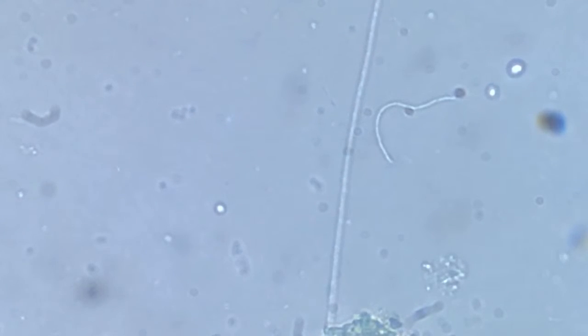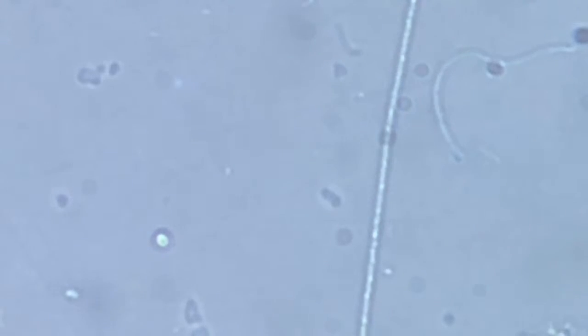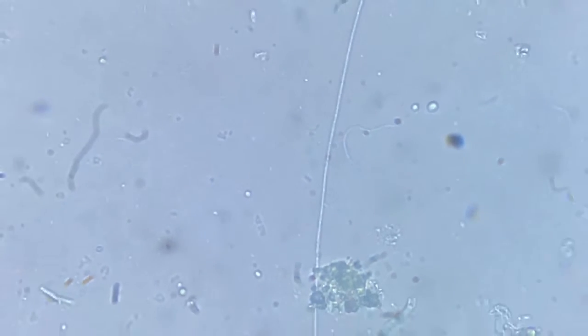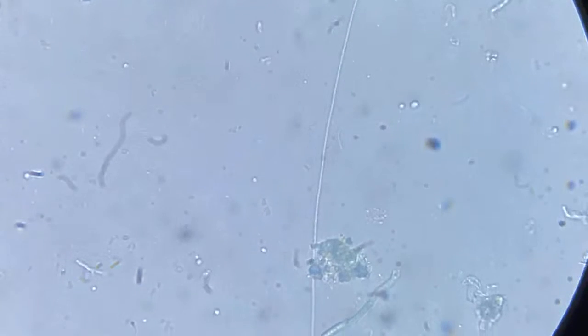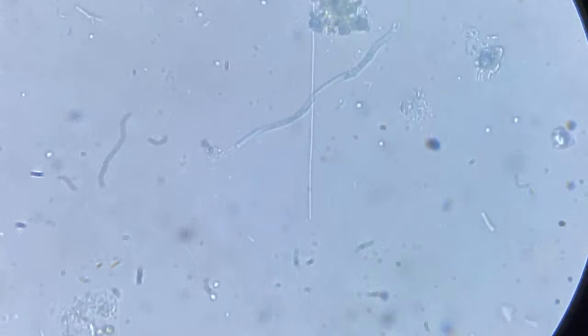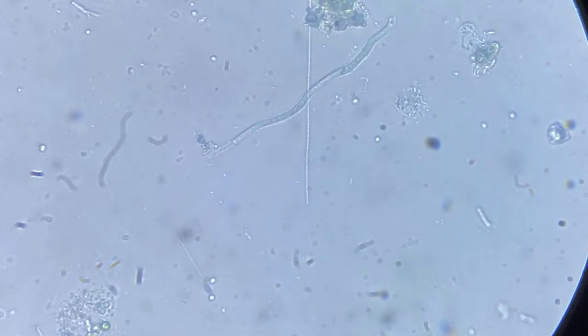There's a defined movement of the body. See this? Now just to bring this in perspective again, see the length of it. See how long it is, straight like a highway, moving like a train.